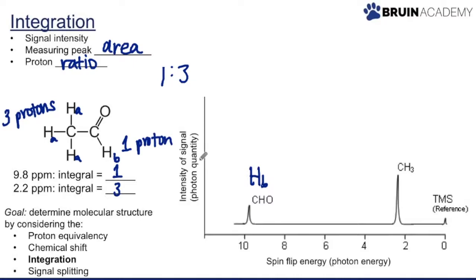In some cases, you'll find that the integral represents the same value as the number of protons and hydrogens in the group, but this is not always the case, so just keep that in mind.